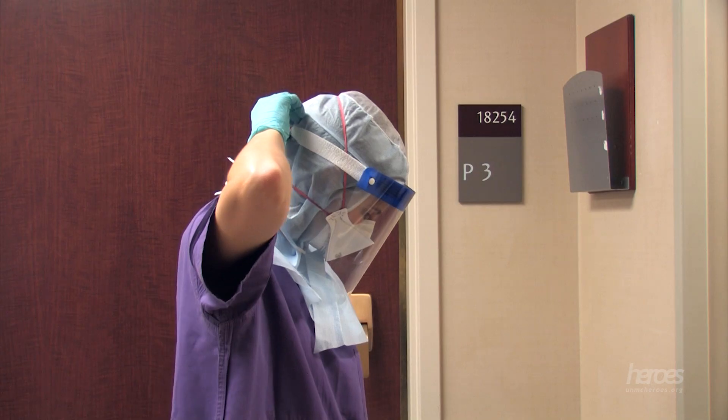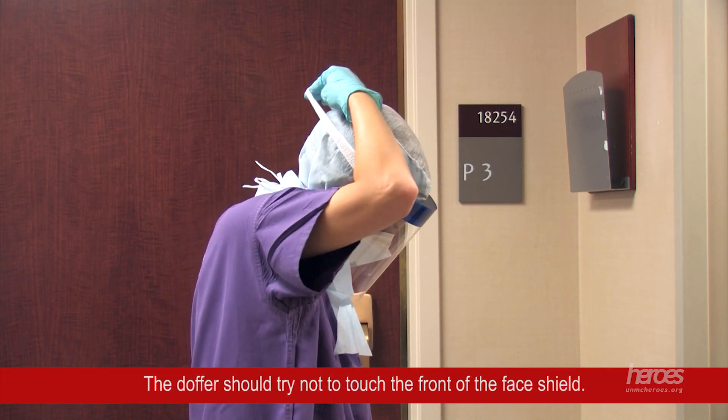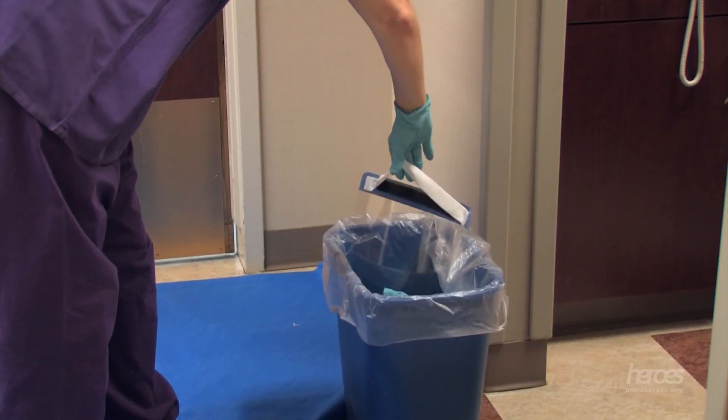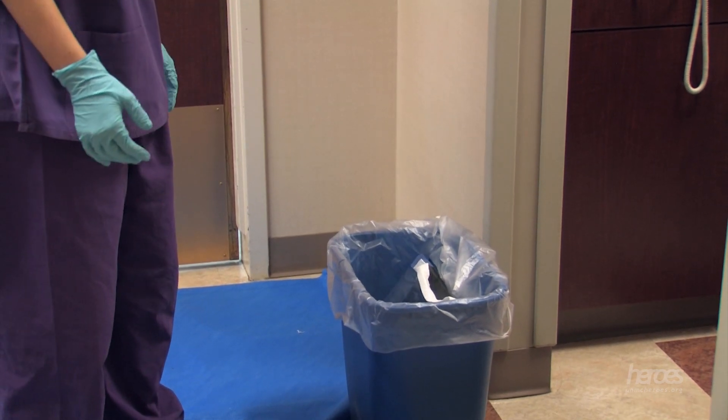The next item to be removed is the face shield. Firmly hold the rear strap and pull it over the head forward, gently allowing the face shield to fall forward. The doffer should then dispose of the face shield by placing it gently in the trash. If worn, remove protective eyewear for cleaning with antimicrobial wipes by the doffing partner.